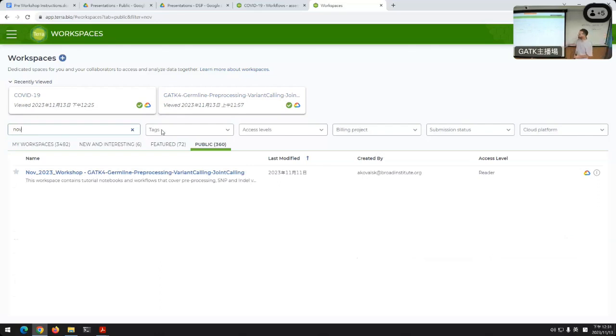This is the part where we're going to slow down to make sure that everyone has found the workspace, has cloned the workspace, all that stuff. We're all going to be on the same page by the end. Raise your hand if you need help. If you haven't found it, please just raise your hand. I'm going to say it one more time, and then I'm going to click into it. So one last time, go to your hamburger menu, click on workspaces until you are in your workspaces section, and then just type in NOV into the search bar. Click on the public tab.